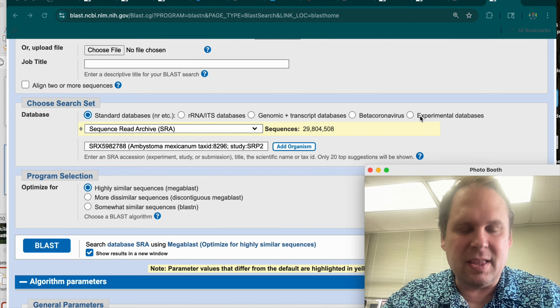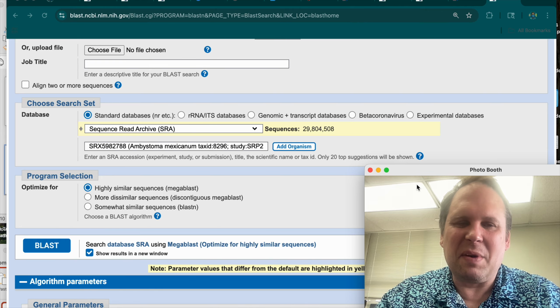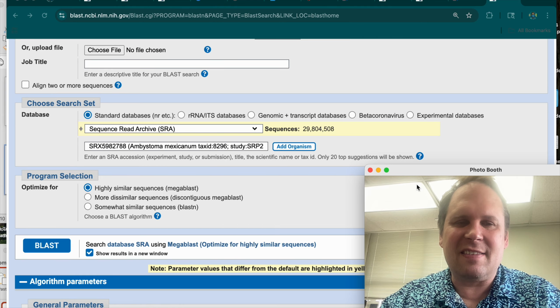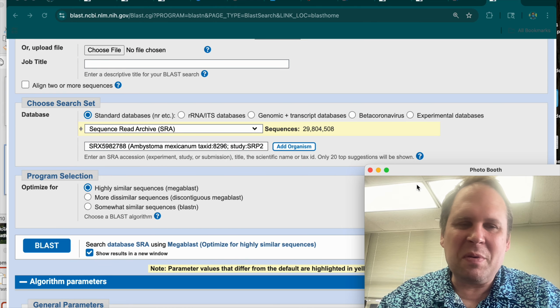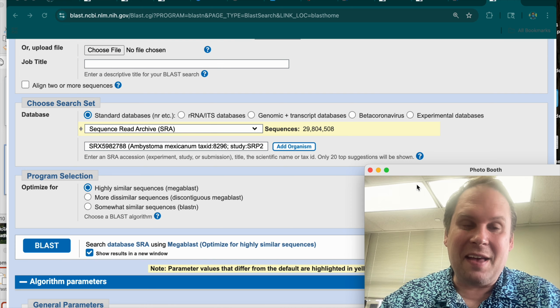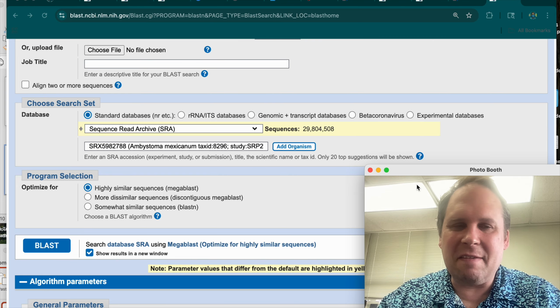There you go. So let's build a virus, not really in a way that hurts people, but let's reassemble a virus that actually exists and is probably ruining something out there today, and is related to viruses that are actually super dangerous to human health, that we probably ought to know a little bit more about. And it's a brand new virus. It's potentially publishable, but there is so much left that has to be done to make these into a publication that I don't think you have time for that right now.